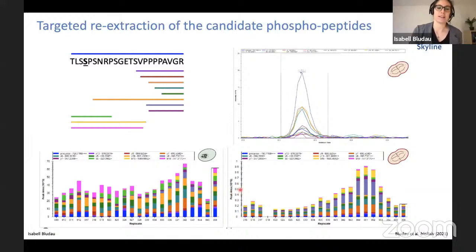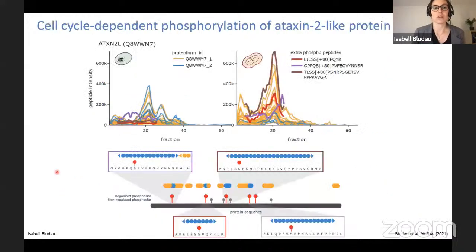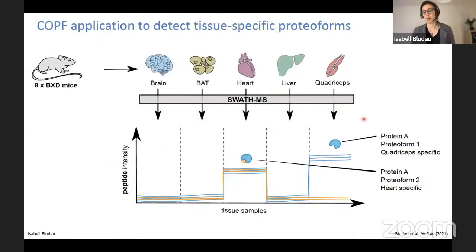range here. And if we look at the interface, we don't really see any elution, like a large peak. So this is again the second dimension, and we are at peak areas in 10 to the 3. So with this, I can conclude that we could detect 3 of the 4 phosphopeptides that we hypothesized. And for 2 of them, we even get a very beautiful coelution signal with the other orange peptides, shown in brown and in red. So with this, I'm almost done.